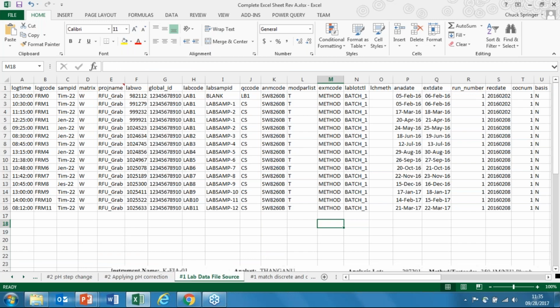That brings us to the next step in this whole process, which is really getting back at challenge number 1 again, which is bringing different sources of data together. And in this case, we've got our lab data. So we're sending off samples, getting extractive analysis of chlorophyll, of blue-green algae.